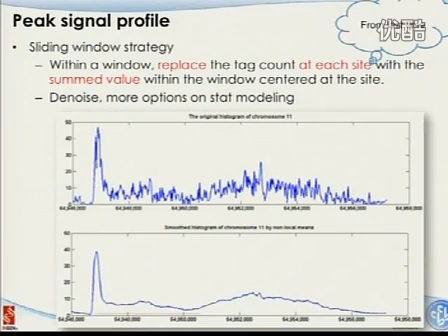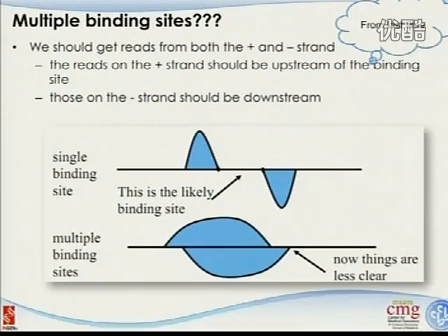We also mentioned that we are assuming this binding site is one independent binding site, with no surrounding binding sites of the same protein. That's why we always assume this type of two peaks, one on each strand. But if multiple binding sites occur, you may see broader peaks in this region.